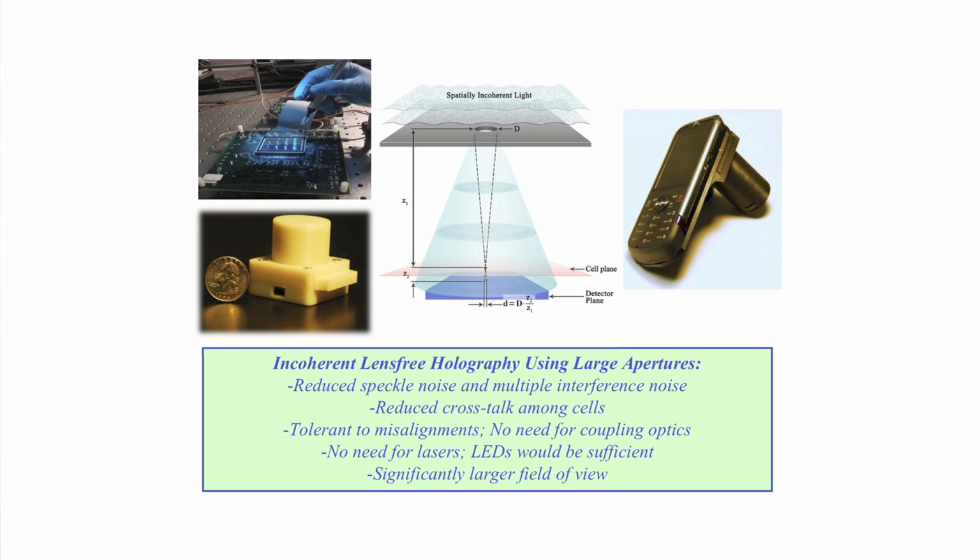All these work based on the same principles of partially coherent holography. It's not based on standard traditional holography that we're accustomed to seeing using a laser, because we do not like lasers. They have too much coherence and they have speckle and multiple reflection interference type of noise terms. That's why we like to use partially coherent light. Actually, we use LEDs, light emitting diodes.